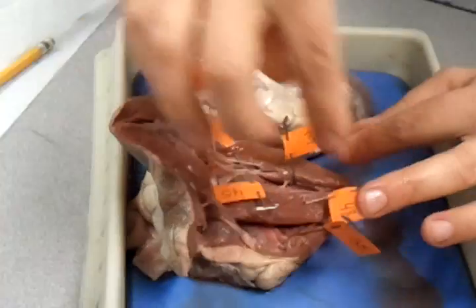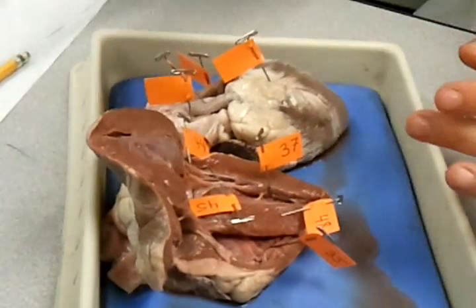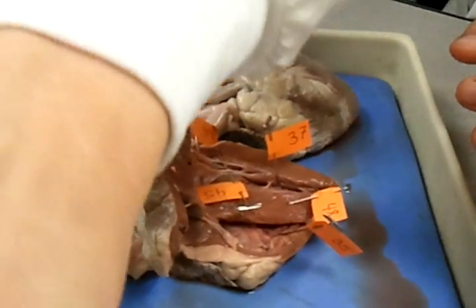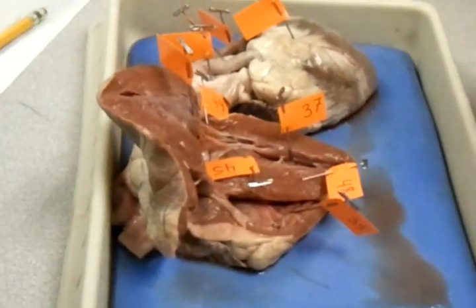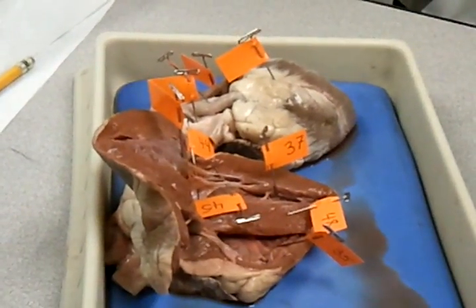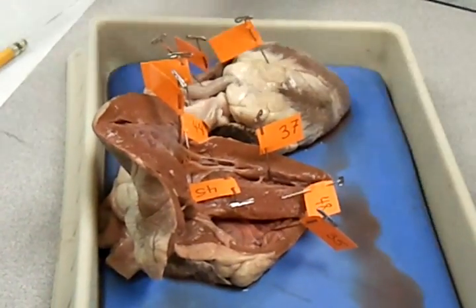And you can do the same thing on the other side. I'm just going to do, because of the pins, one side. And then what are the muscles called that the heartstrings are attached to? These big muscles, finger-like? Papillary muscles. Exactly. The little bumpy muscles. They're easier to see down here, but I'm pinning them on the top because of the heart.